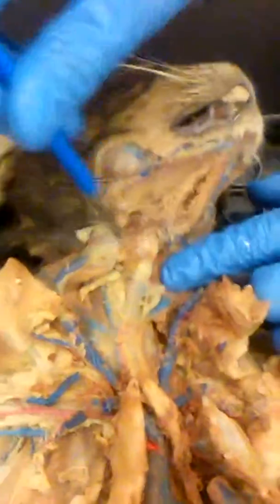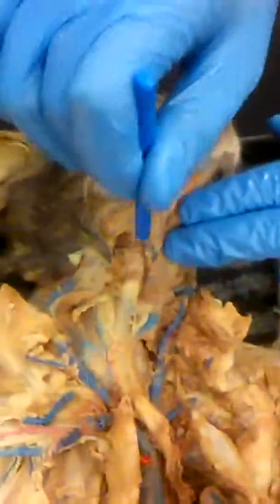So the thymus is going to sit over the heart. The thyroid's going to be up in the neck. It's kind of sitting over it right here. Thyroid. Alright. And then there's pancreas.